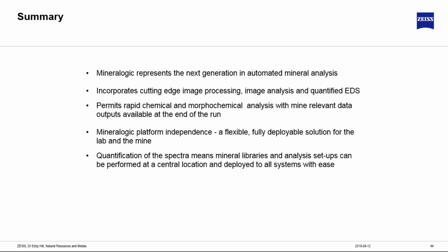Since we're not dependent on a specific amplifier or specific detector, and we're not looking at the spectra itself, but we're actually quantifying that spectra, the quantification method is the same for all the systems. So mineral libraries can be created centrally with ease, since we're using the stoichiometry of the mineral, and emailed and rapidly imported into any Mineralogic system in the field.